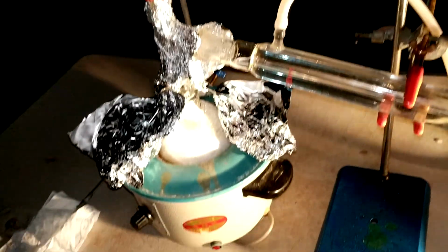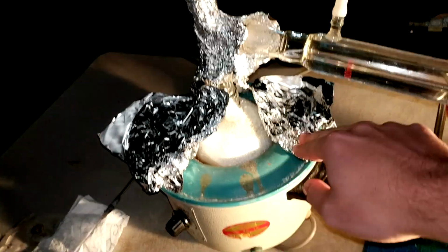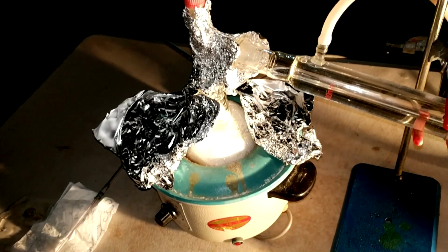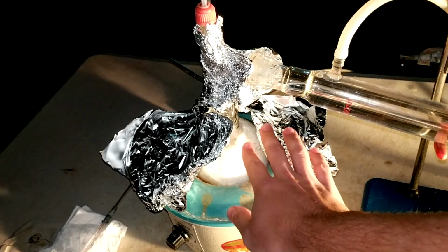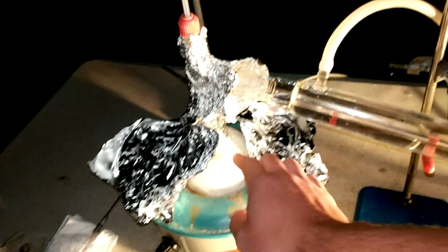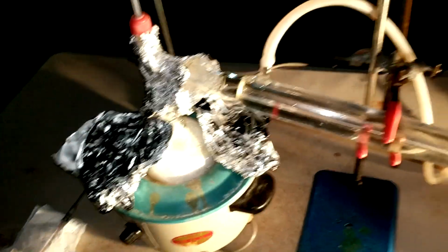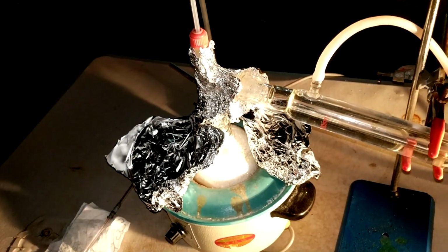It is stopping it from reacting, because if I took away the heating mantle, there'd be hardly any crystals along the bottom, and they've all just kind of sublimed and ended up here. So I'm just going to get the blowtorch, because I don't think a hairdryer is going to be hot enough, because it's already pretty hot, but it's all just sitting on there. If I blowtorch it really lightly, I should be able to melt this stuff around the top down, and that should fix the issue for now. And as it keeps reacting, it'll be less and less of an issue.